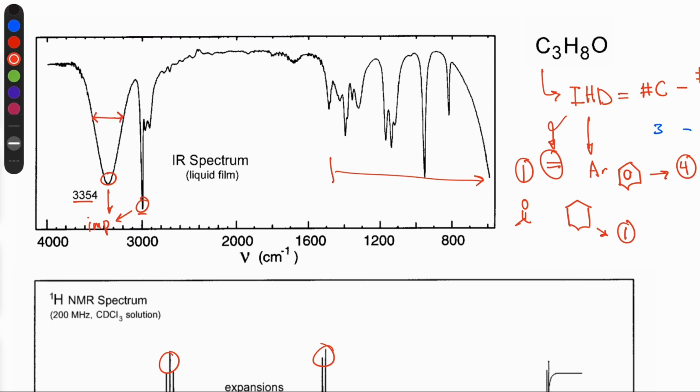As you can see, it's a broad absorption band, which shows the presence of a hydroxyl group. Hydroxyl groups usually have a broad band in the spectrum, and they also appear at about 3300. And as we can see here, everything matches the presence of a hydroxyl group in our compound. So we can be sure about this. I put a check mark next to it.